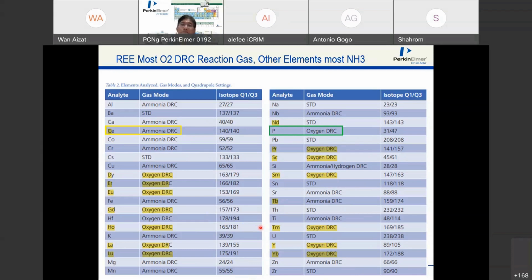It's able to change to ammonia anytime because the difference between ammonia and methane is the turbomolecular pump used in the ICP-MS. With ammonia, there is an argon purge to protect the turbomolecular pump. So that is the difference.